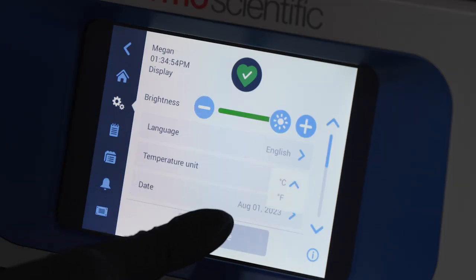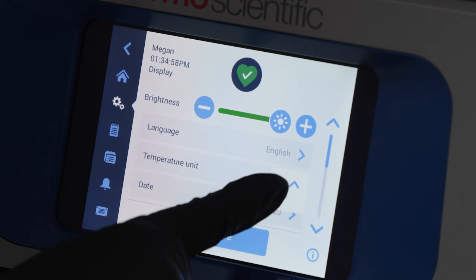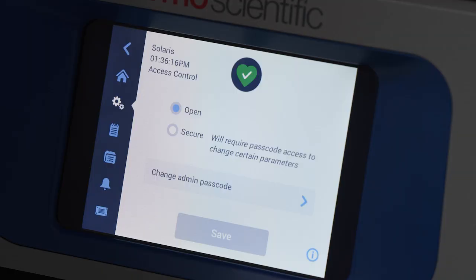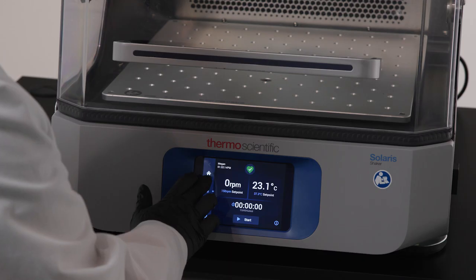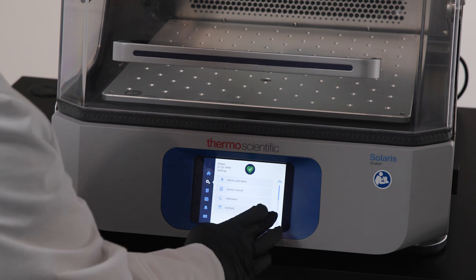You can also choose to display temperature in Celsius or Fahrenheit, personalize the thresholds for your unit's alarms and alerts, and set up the secure mode administrator features and passcode. These settings are adjustable and can be changed later by accessing the settings screen on your display.